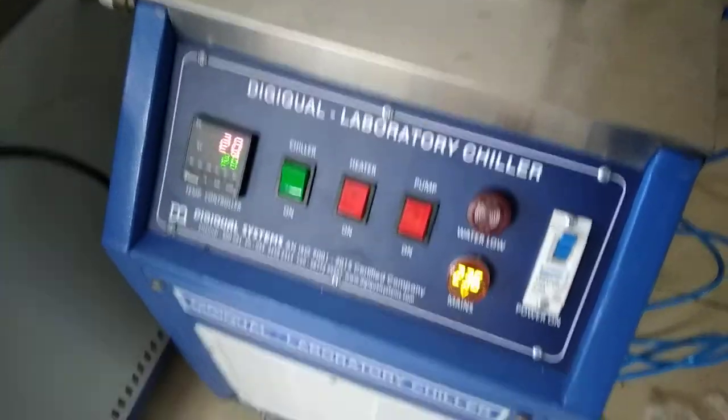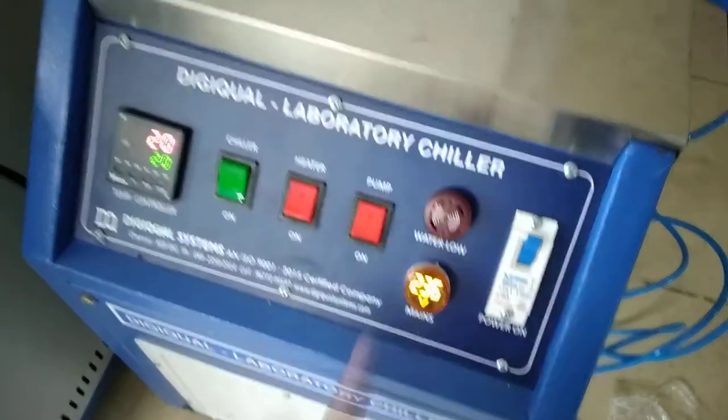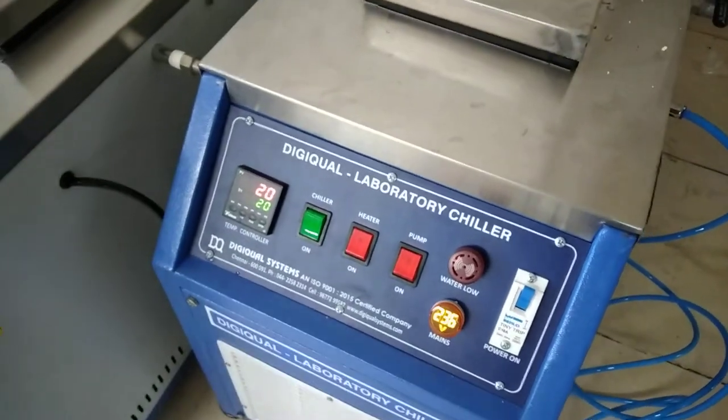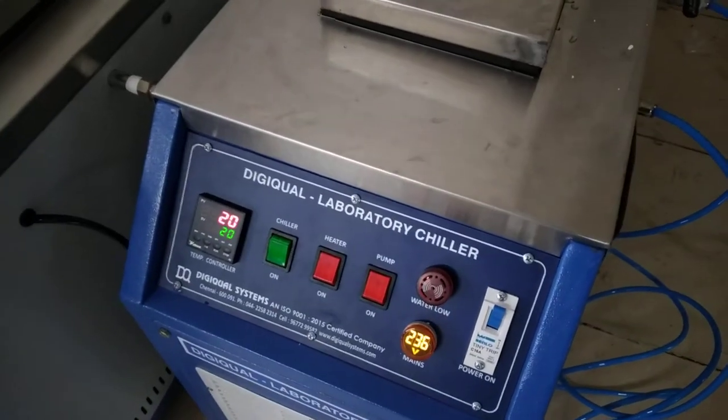You can see the panel — chiller on, heater on, pump on. The temperature range of the chiller is minus 10 degree to 90 degree, both heating and cooling.